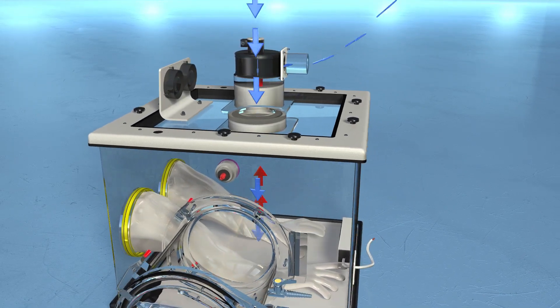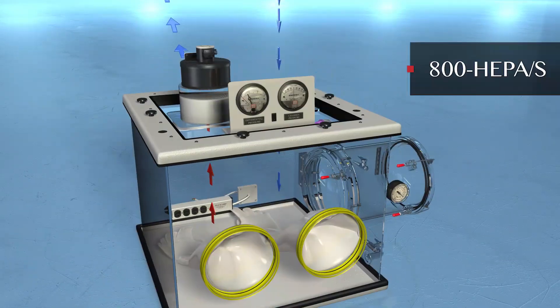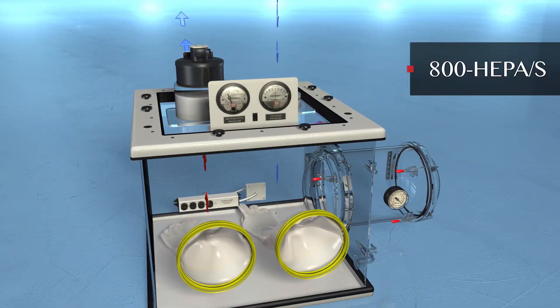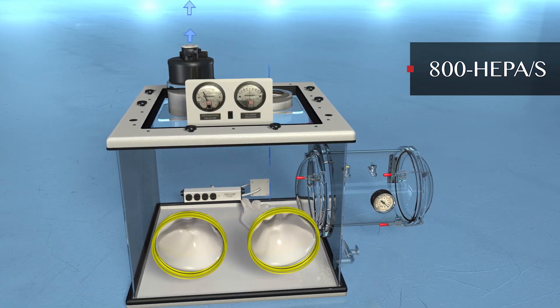Plaslabs offers three types of HEPA filtration setups. 800 HEPA S. Single HEPA filtration provides HEPA filtered air into or out of the glove box.